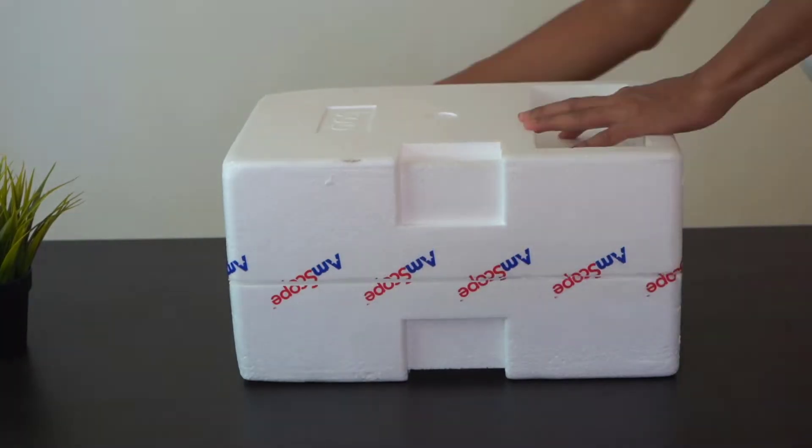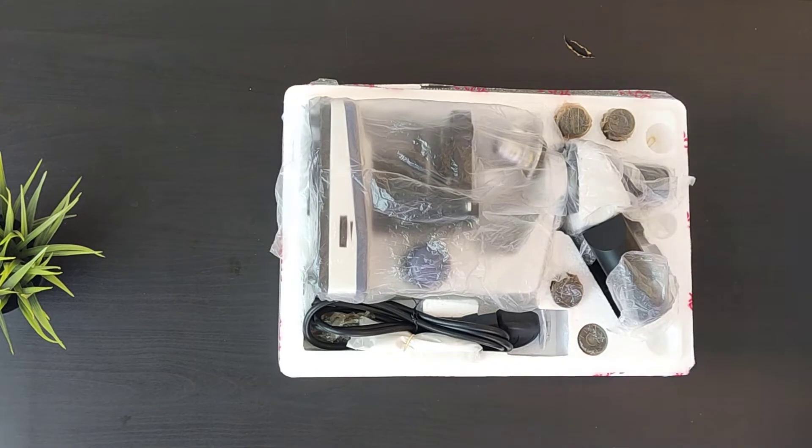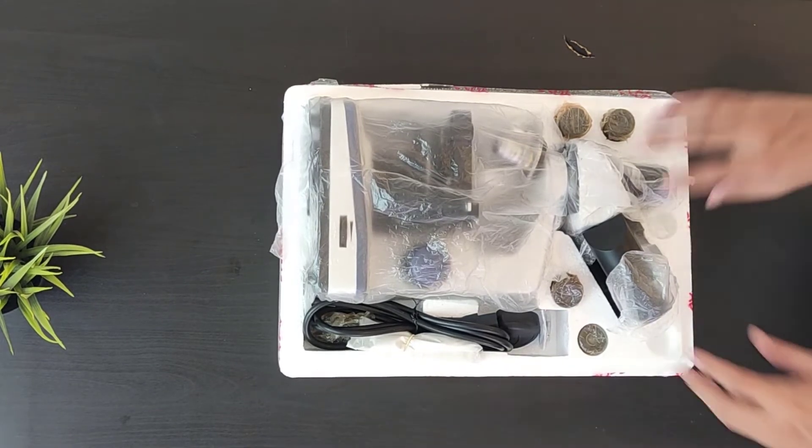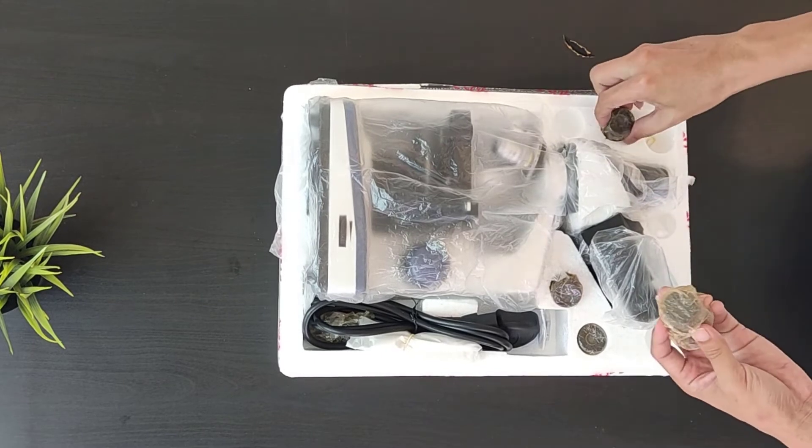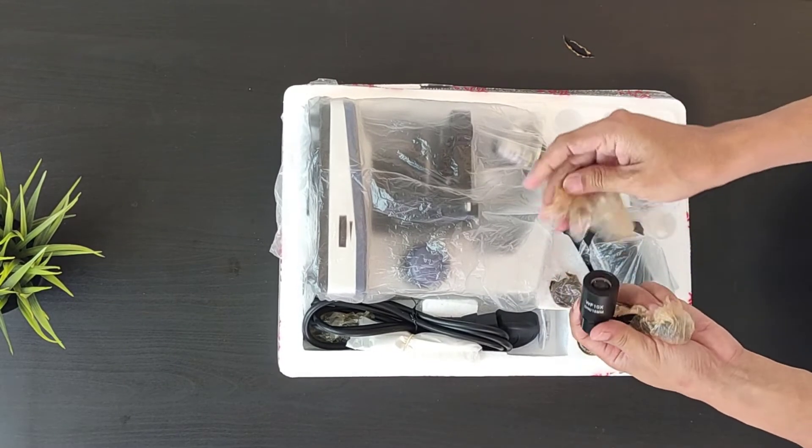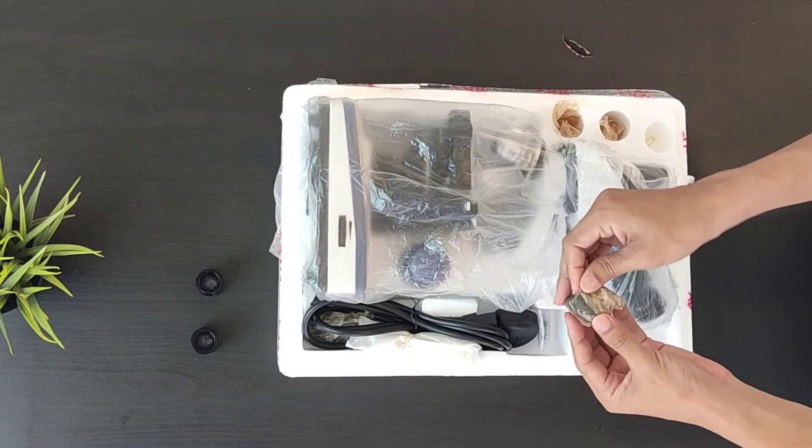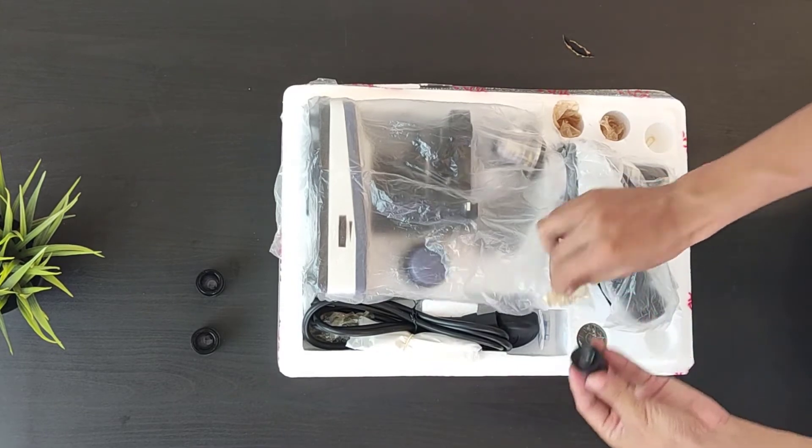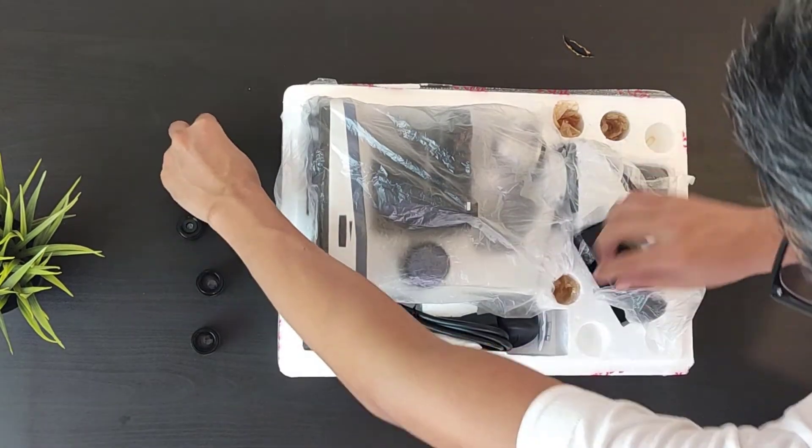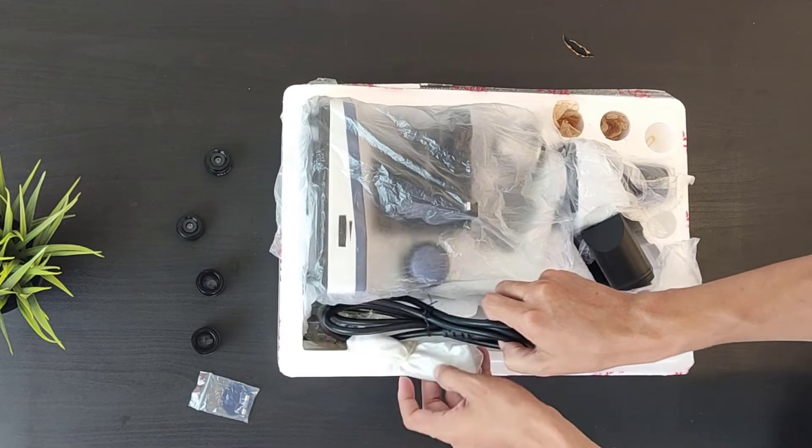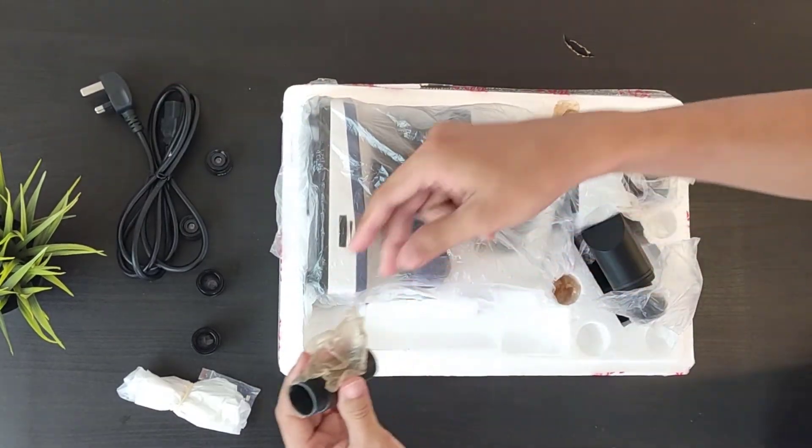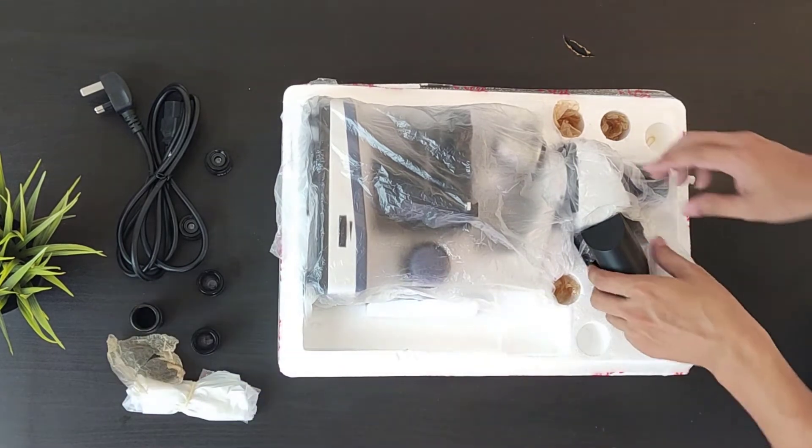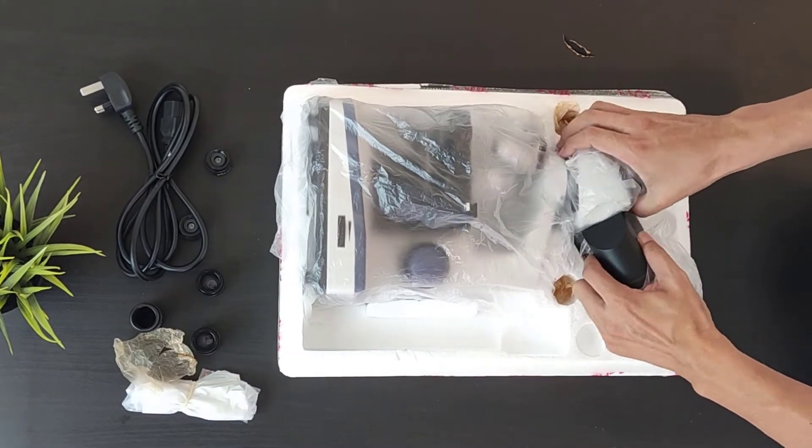So what you receive may be different depending on which model you bought. The T120C has a pair of 10x eyepieces and a pair of 25x magnification eyepieces. It also comes with a blue filter, a power cord, and also a trinocular head. Now let's try to assemble the microscope.